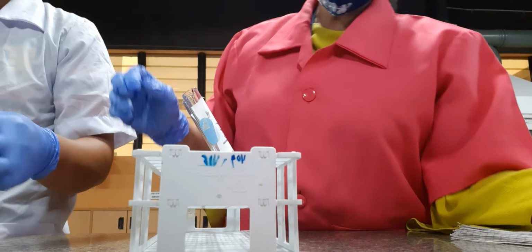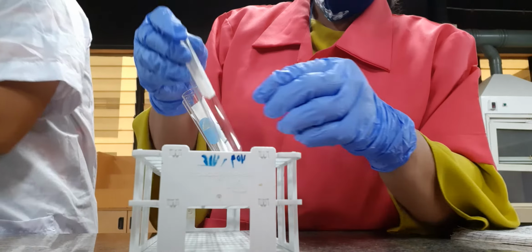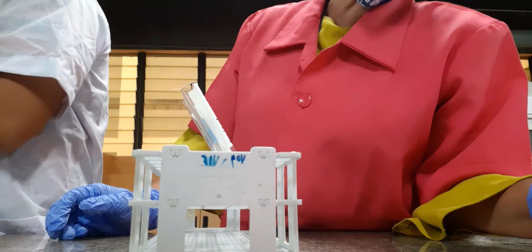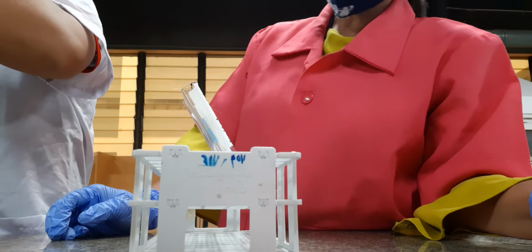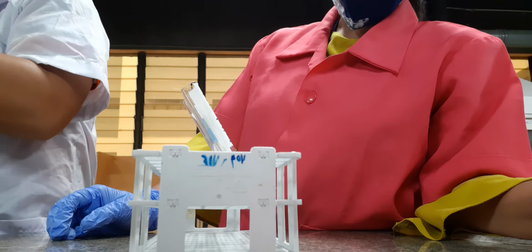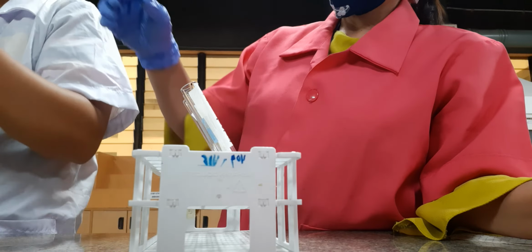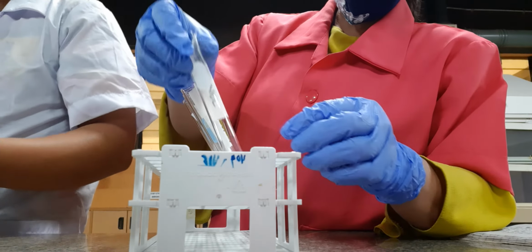And then ethanol. And then we have tert butyl alcohol. So it is the same as the other test tubes.